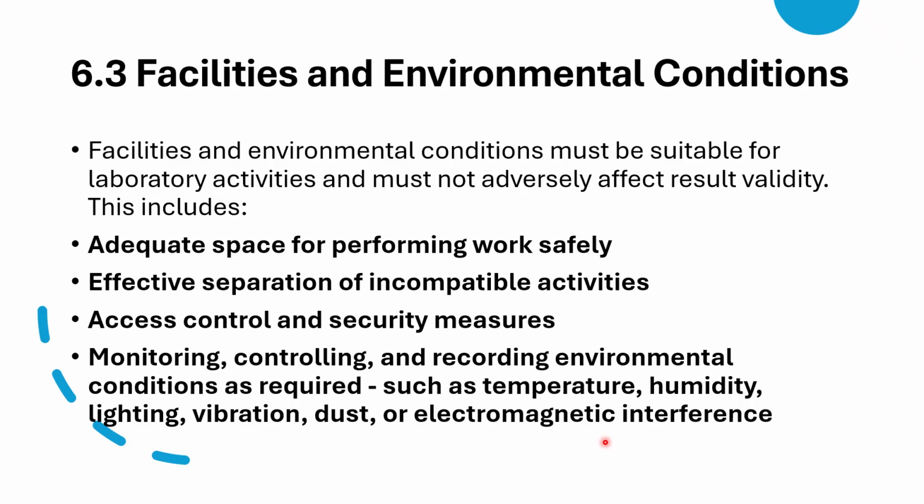The laboratory must implement measures to prevent contamination or cross-contamination. When work is performed at sites outside the permanent laboratory facility, known as field testing, the requirements of this standard still apply.